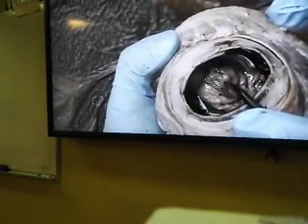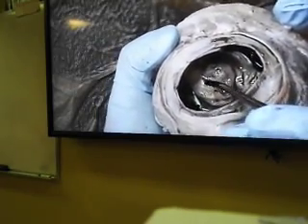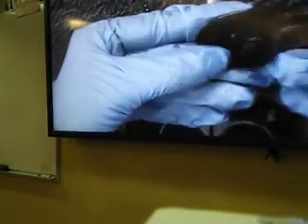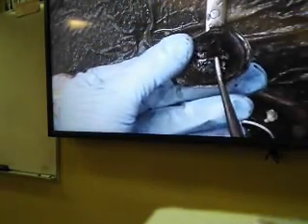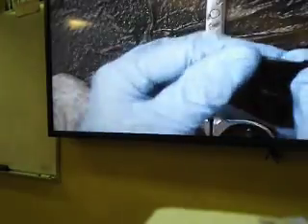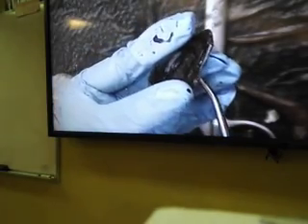Then we come to the inner layer, which contains the structure retina, and it is the nervous tunic. The cavity is the posterior cavity, which contains vitreous humor. Here is the anterior cavity, which had aqueous humor, and on the anterior cavity we saw the whole pupil. Surrounding the whole pupil is the iris and ciliary body. So iris, ciliary body, choroid, all part of the middle layer vascular tunic.